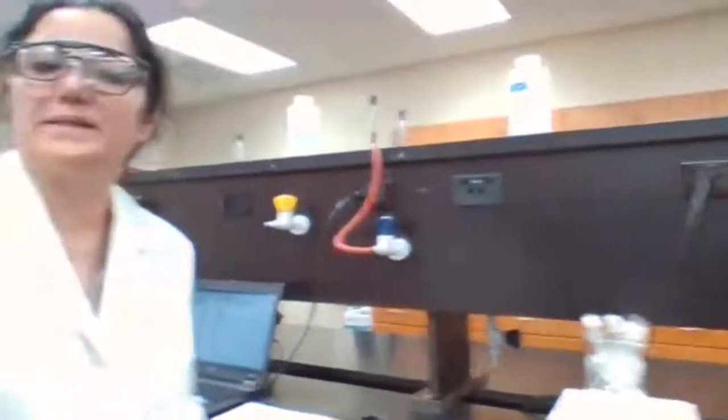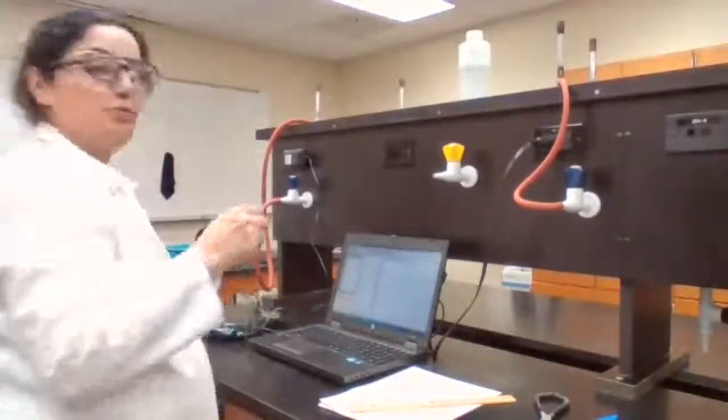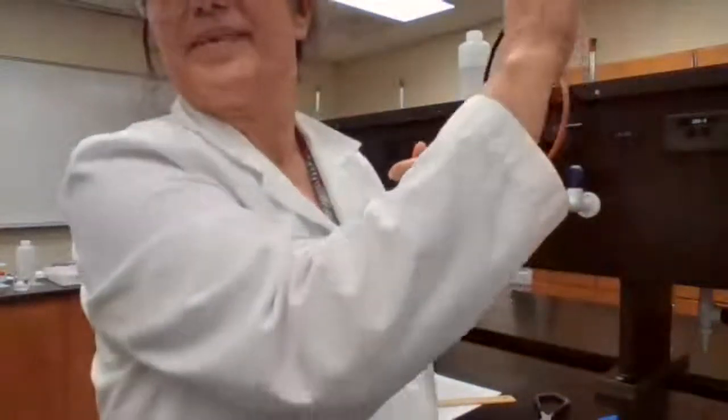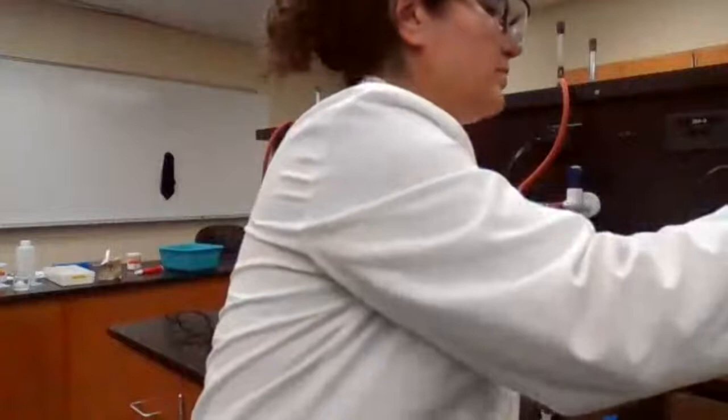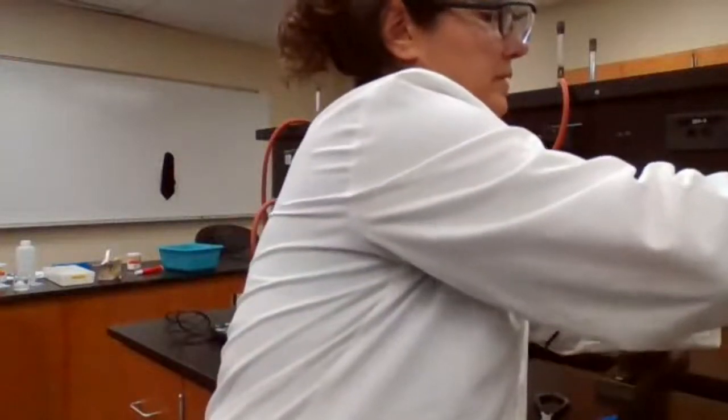Okay, your next step is we're going to use the probe to mix it. Which one do you think would dissolve first? 1, 2, 3, or 4? 1. I'm going to work with test tube 1 first.